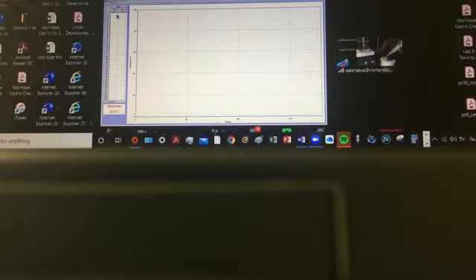Alright, so line number 3, the third line, that would say the hot temperature of the metal. The initial temperature of the metal is the hot temperature of the metal, because I'm trying to heat it. So the third line, leave it blank for a second. I can answer the fourth line, the initial temperature of the water inside the calorimeter.